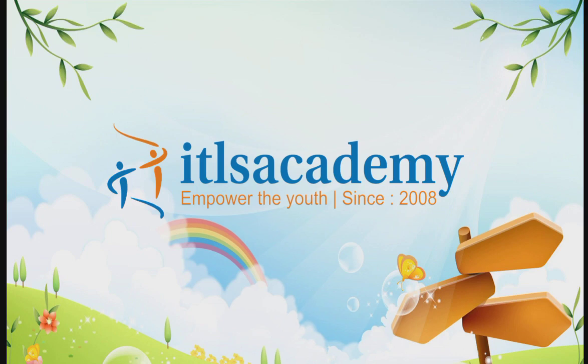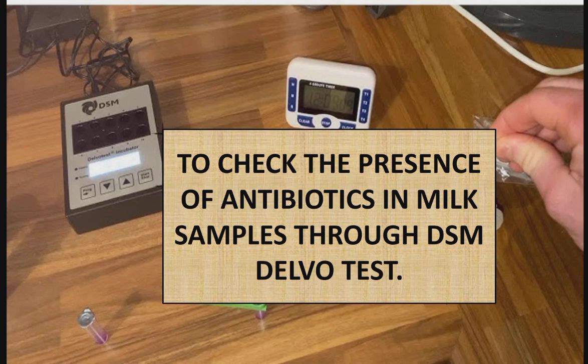So today in this lecture we are going to study a new experiment, that is to check the presence of antibiotics in a milk sample through the DSM DELVO test. In this particular lecture we will study how you detect the presence of antibiotics in different dairy products. Today's study is based on milk. So how do you detect the presence of antibiotics in a milk sample?